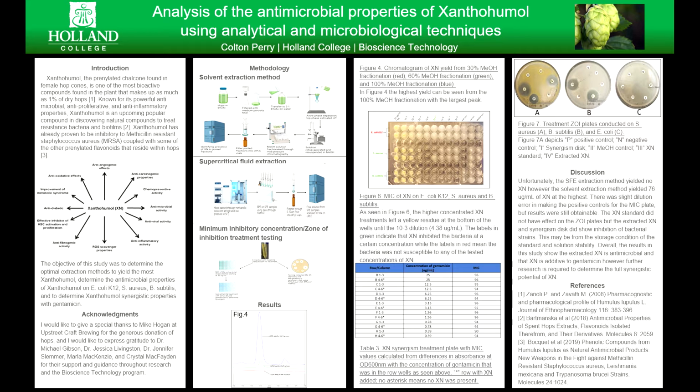Moving into the methods of this study, the solvent extraction method can be seen here above.